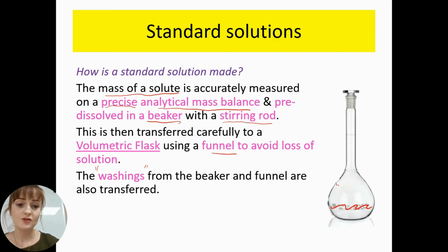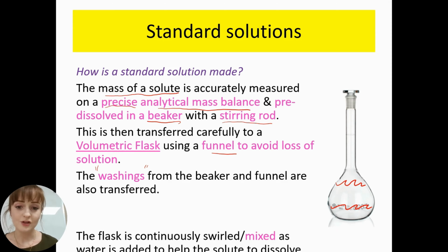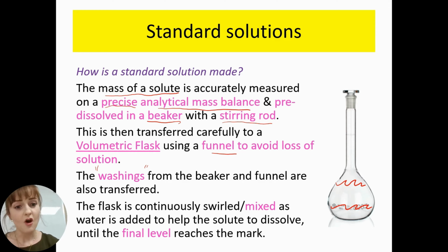At this point, my solution is probably a little bit higher up in my volumetric flask. The last thing I will do is make sure that I fill up to the mark on the volumetric flask with distilled or deionized water. While I'm doing this, I'll make sure that I continuously swirl it and mix it so that I get a completely homogeneous solution. When I'm done, I'll also stopper it and invert it a couple of times too.